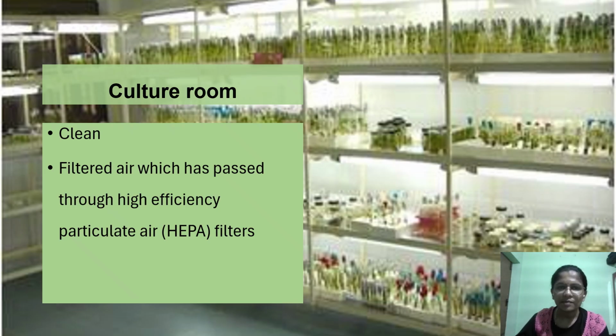So, in this particular lecture, you have seen many things: the possible ways of contamination in the tissue culture process and how to avoid this, and what sterilization is. Sterilization is maintaining an aseptic condition or killing the harmful microorganisms. This was already explained in the very basic class. So sterilization, the two types, what equipment is used and how to maintain this equipment. All these things you have seen.